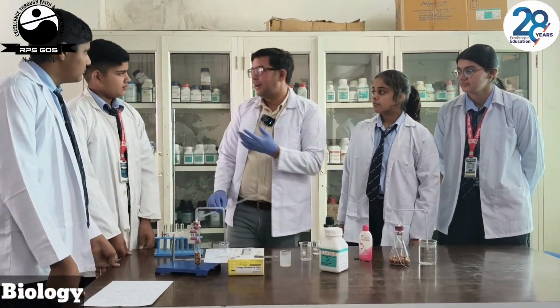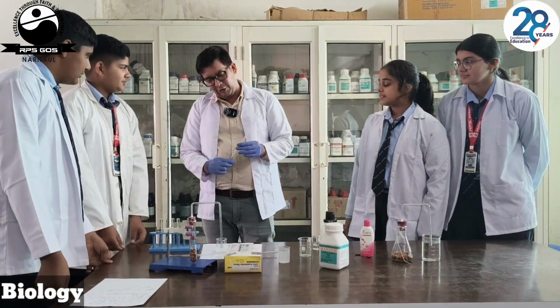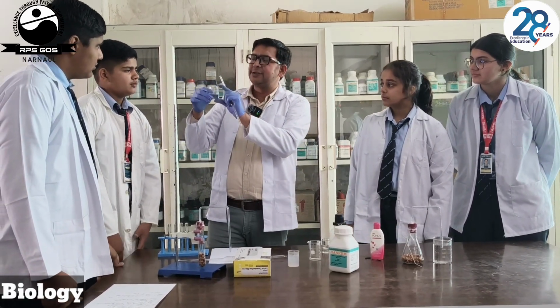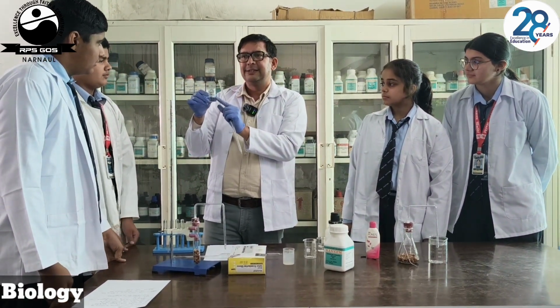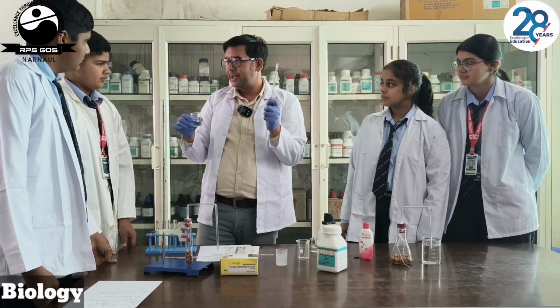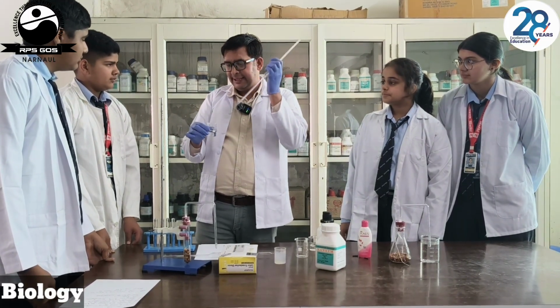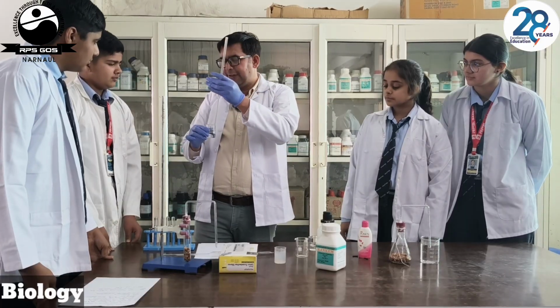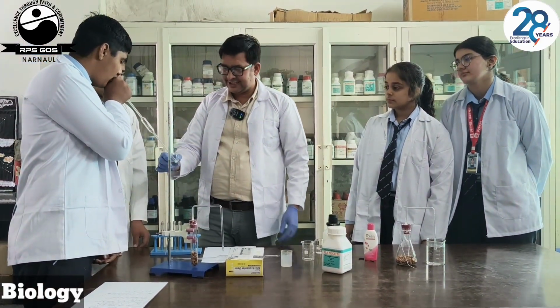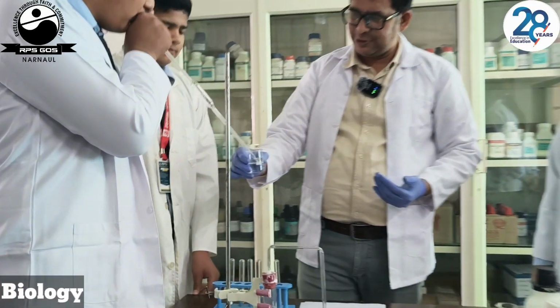Okay, students, do you want to perform this experiment? Yes. Okay. Now, this is for you. This is the small beaker having the lime water. This is the pipette. Blow the air in this pipette. It will slowly turn milky. Do it yourself. Yes, do it.